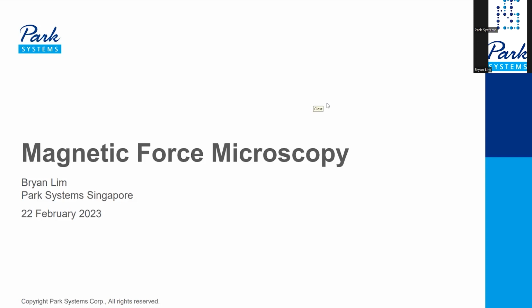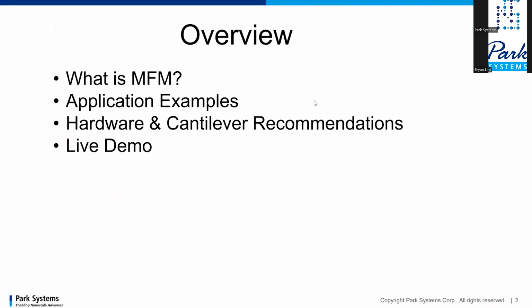Today I shall talk more about magnetic force microscopy, followed by a live demo. I'm going to share what MFM is, give some application examples, and some hardware and cantilever recommendations, followed by the live demo.